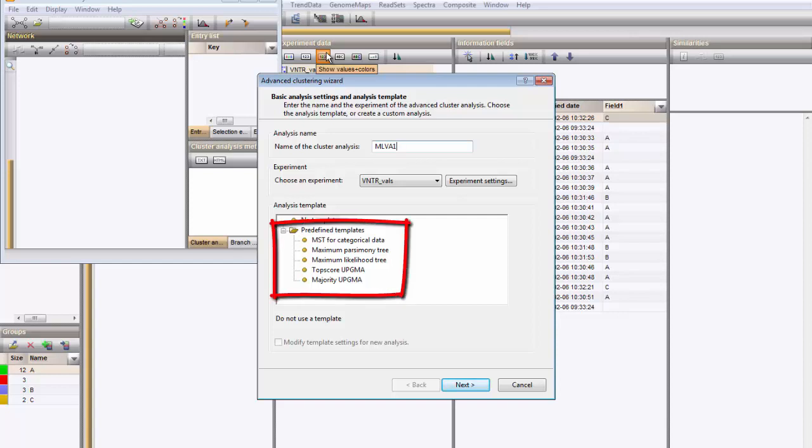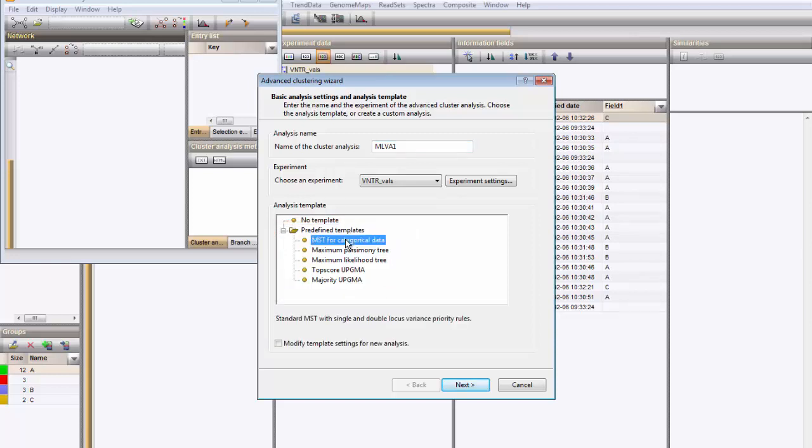One of the available predefined templates is Minimum spanning tree for categorical data. I choose this one and I click on Next.